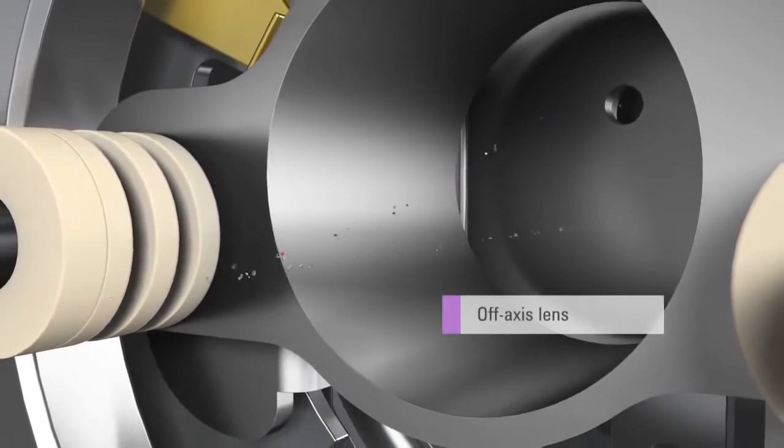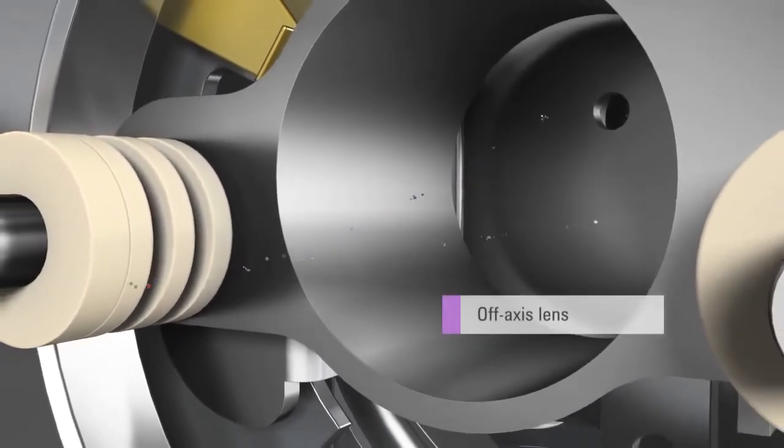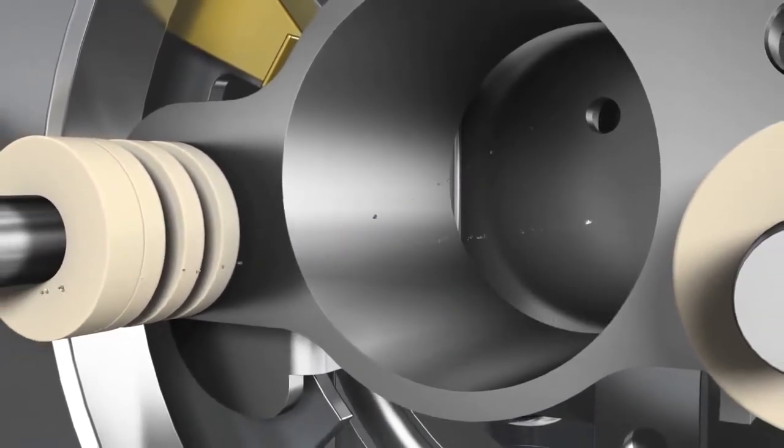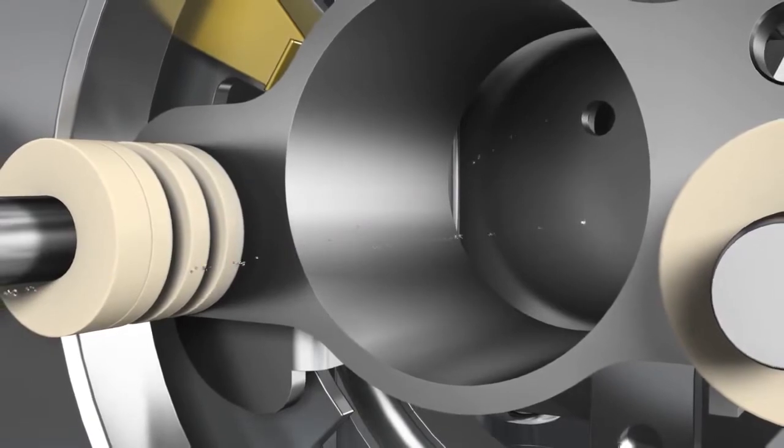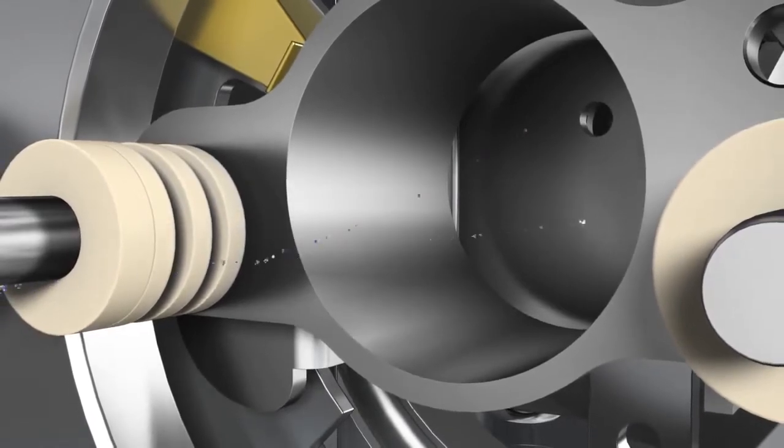The off-axis Omega lens deflects the ions into the collision reaction cell while rejecting photons and neutral species, which would increase random background noise.